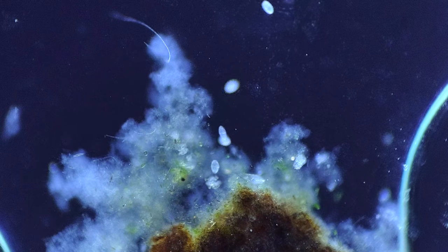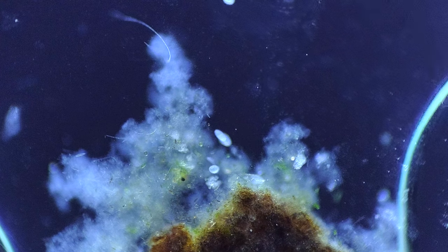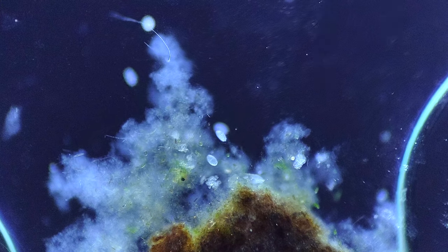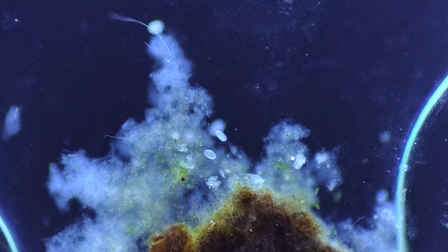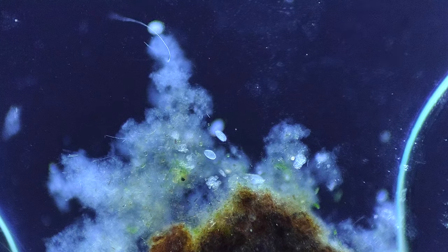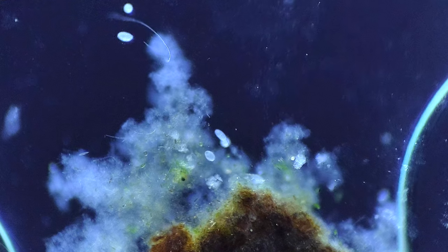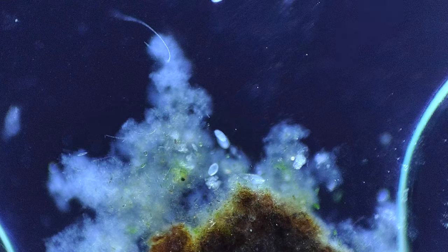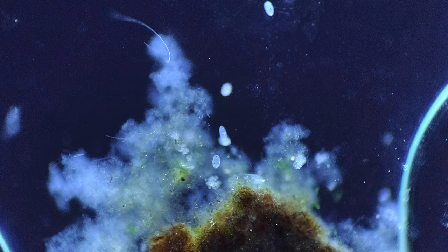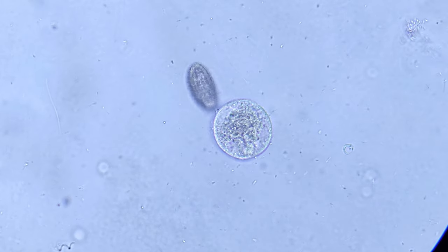This image was made with a relatively simple and inexpensive $220 microscope using an imaging technique called dark field. This is where the specimen gets a lot more light than the background, so it looks like the microorganisms are glowing in the dark. Now normally you would need a microscope with a condenser lens, but the dark field technique used here is a bit different. It can be used with much less expensive microscopes, like the ones for kids that cost less than $70. This is because this type of imaging doesn't even need a condenser lens to get these very nice results.